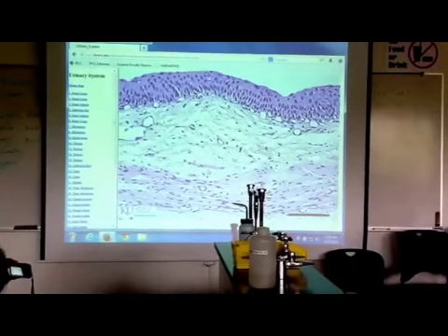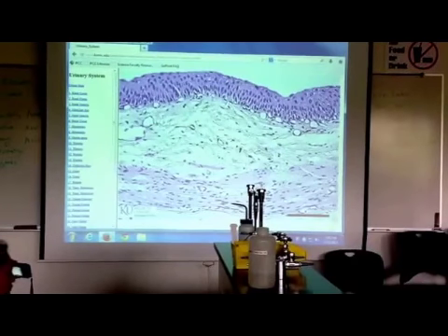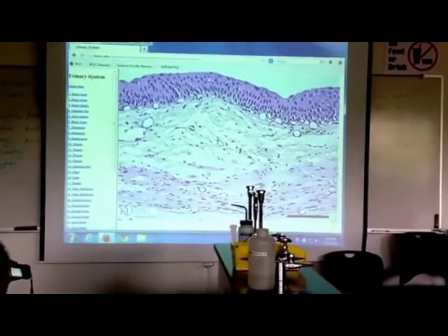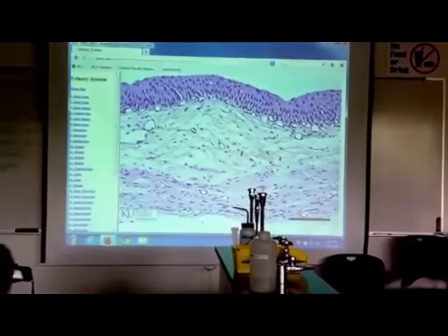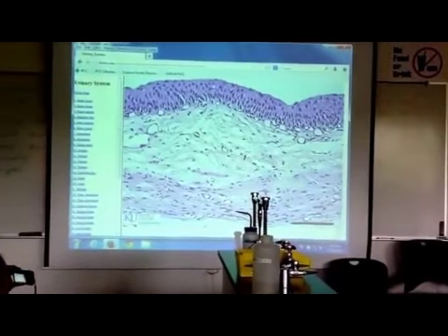You can find the corpuscles and name what you see. You know, it's a kidney and tubule. That's pretty much the histology of the kidney, urinary system. The rest of it is pretty much on the models. Okay. Make sense? That's pretty much kind of all.